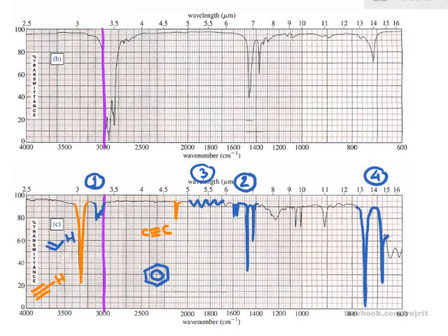Okay. If you have these 4 characteristics, you can be sure that this is benzene. But sometimes when you have more functionalities, they may appear around 1600, for example, and may overwhelm or dominate the peaks in the second and third characteristic regions.